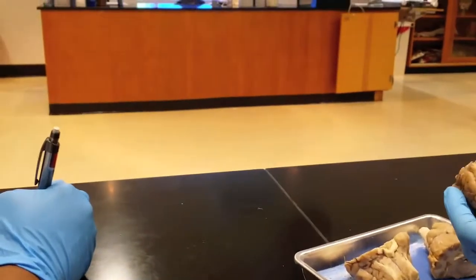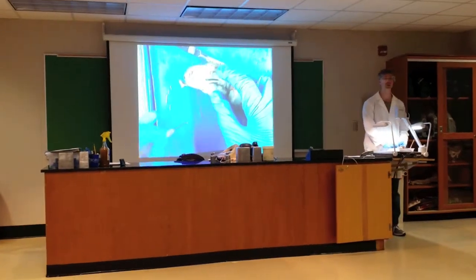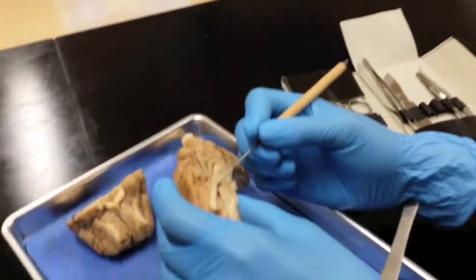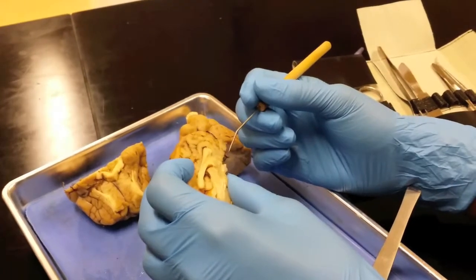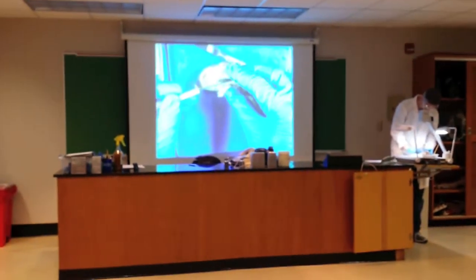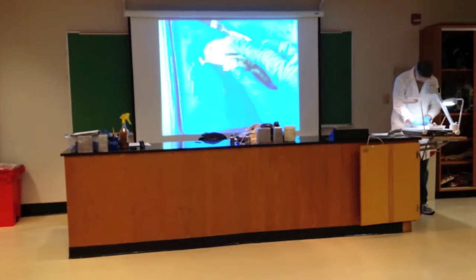Not the membrane, but the opening directly below the corpus callosum would be the lateral ventricle. There are 2 of these, one on either side, so depending on which brain half you got, you'll still have a lateral ventricle to identify. And if you look carefully inside the lateral ventricle, you should find some delicate... let me see if I can zoom in on it a little better.